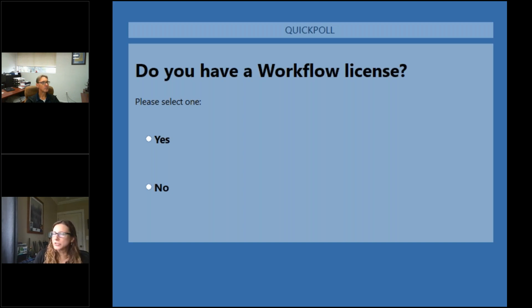I don't have any questions yet, just so everybody knows. We do take questions throughout the webinar, so if there's anything that you want to ask about, I can ask them during the polls. Or maybe if it's really relevant to what he's talking about, I might jump in and interrupt Fraser.